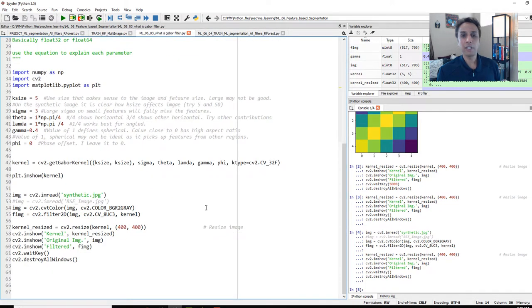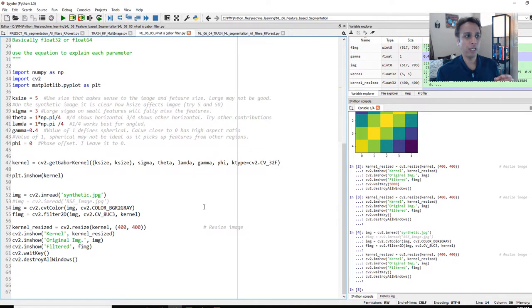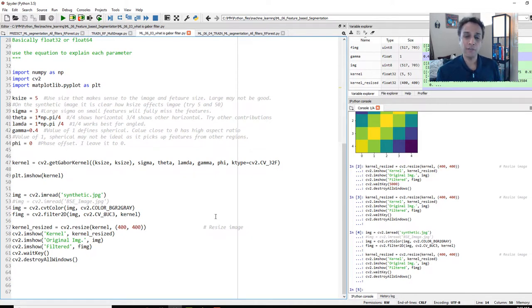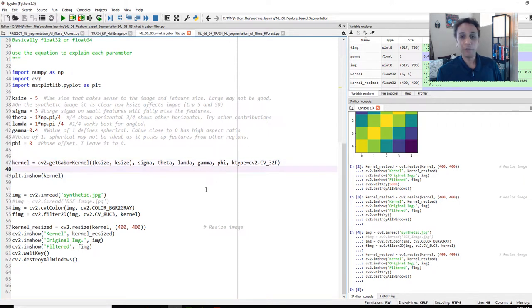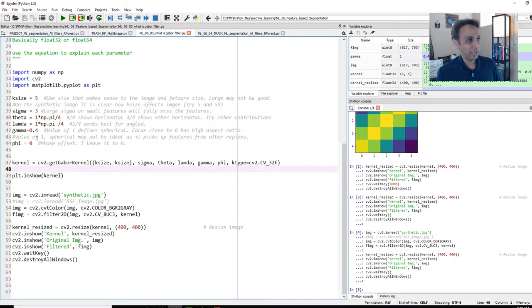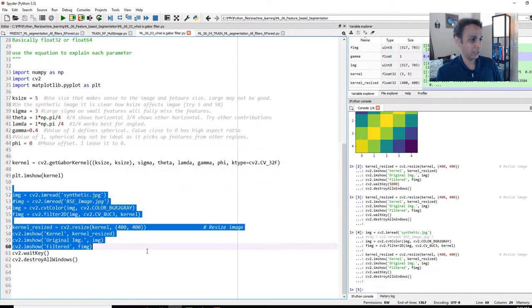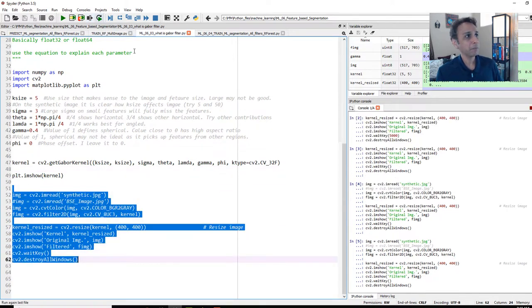One quick note before jumping in. Gabor filter is my favorite when it comes to traditional machine learning because it's one convolutional filter where you can generate thousands of filters from one. By changing the kernel size, by changing sigma, theta, lambda, gamma, you can actually create a whole bunch of filters. So in this example, I'm defining these parameters. And let's actually go ahead and run this so you can see exactly what I'm talking about.